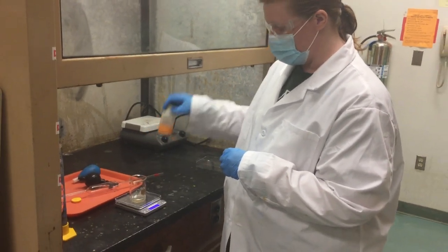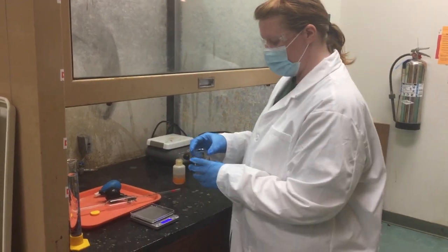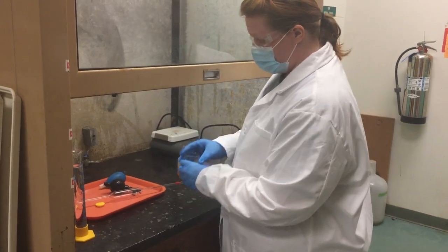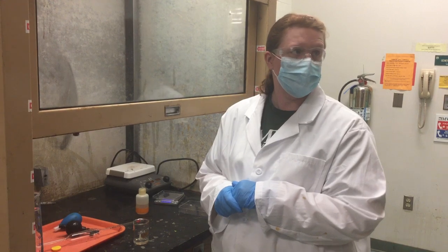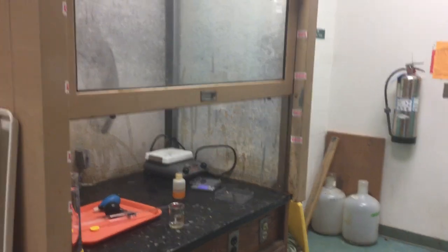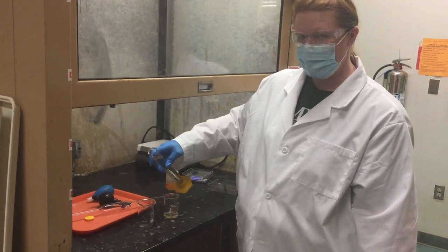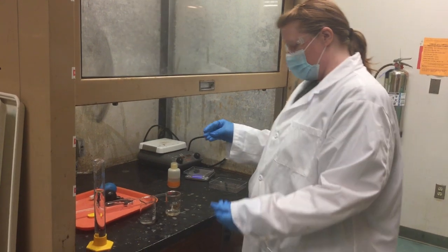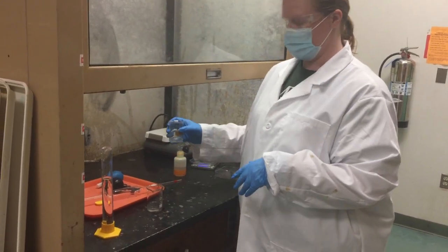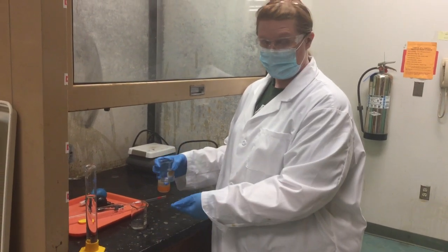If you put too much in, do not put it back into the stock bottles — just put it in the sink and rinse with a lot of water. Once you have your concentrated acid, and later your concentrated base, you'll notice I'm in the hood. That's because the first step is really important so you don't create a noxious cloud of stink. Put a little bit of plain water into your beaker — about 20 to 30 mL. Then take your concentrated acid or base to the hood to dilute it. You always put your concentrated acid into the water, not the other way around, because it has to diffuse some heat.